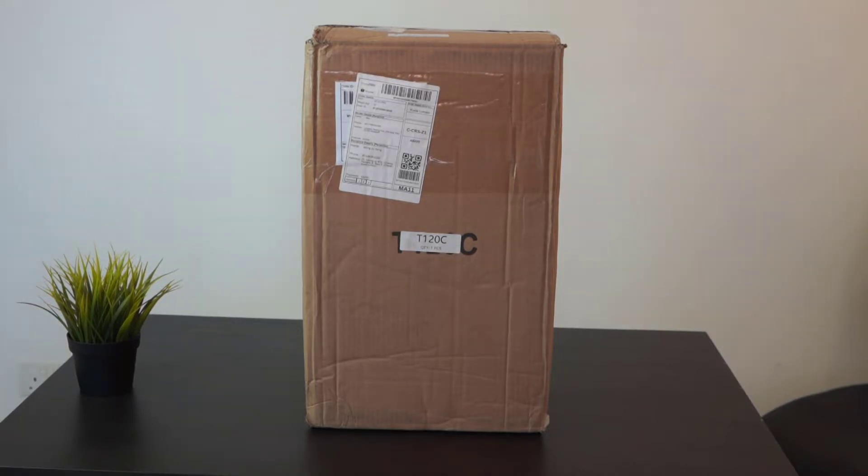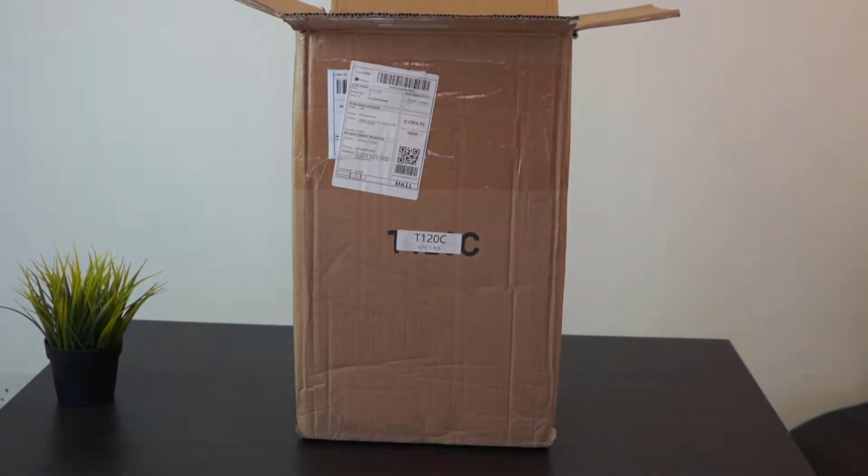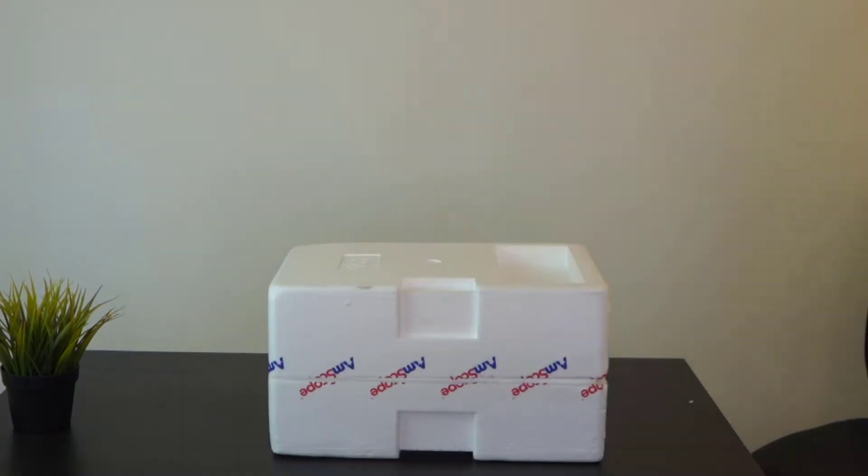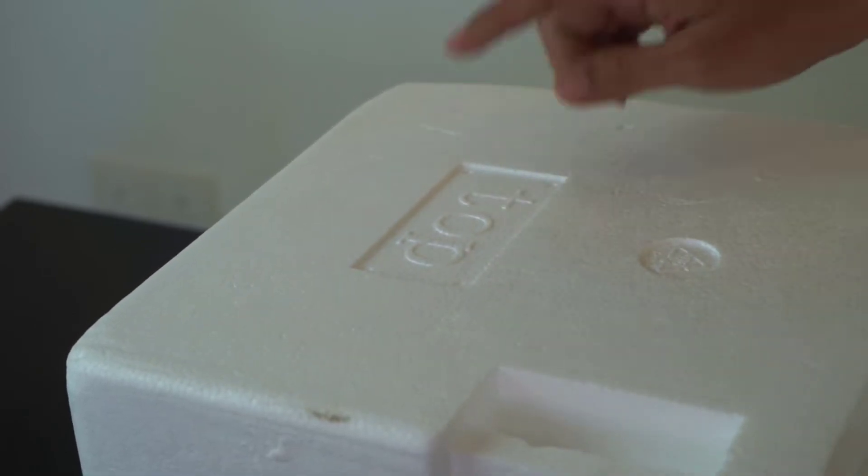Hi guys, today we will be unboxing the Amscope T120 microscope. So if you have ordered one through the internet, this will be the box that you are getting. Do make sure your polystyrene box is facing top before removing it.